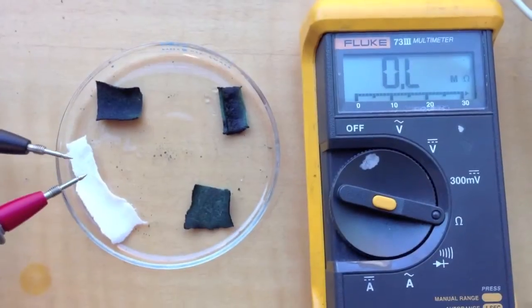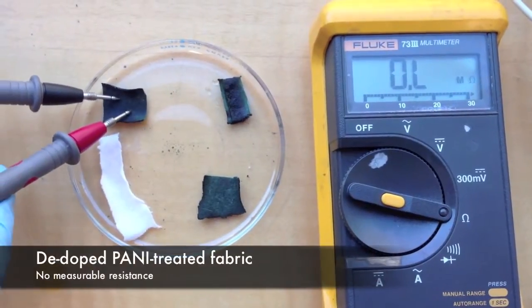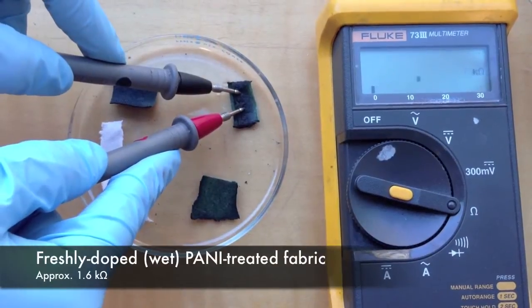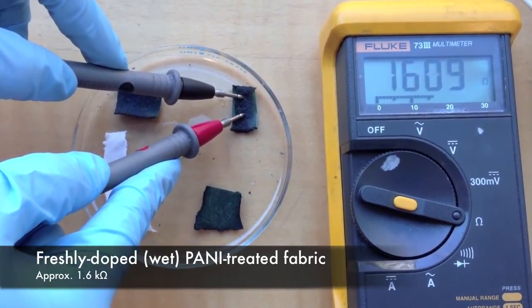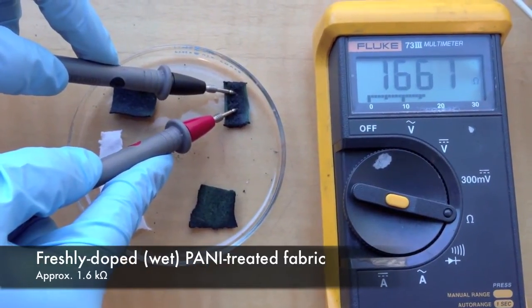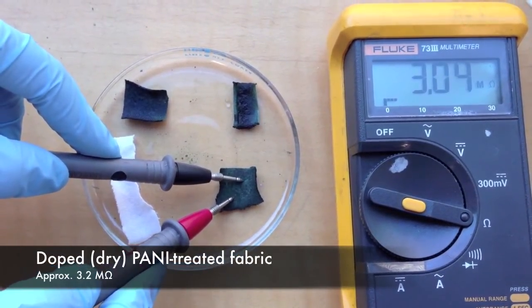We then measured the conductivity of various samples at different stages of the process. First, we tested plain t-shirt fabric before treatment. Then polyaniline fabric before being doped. Then freshly doped polyaniline fabric that had yet to be dried, where we see the highest conductivity. And finally, the polyaniline fabric that was doped and dry, which had decreased conductivity but is still conductive.